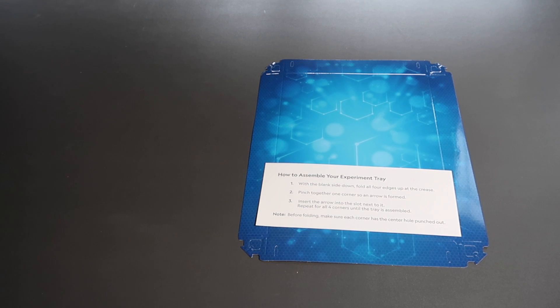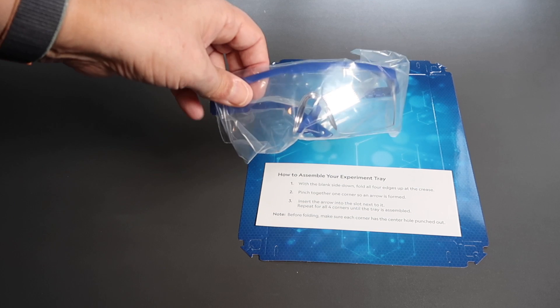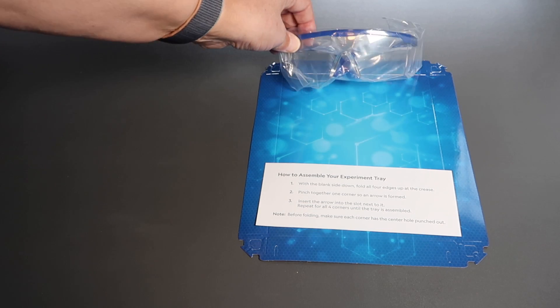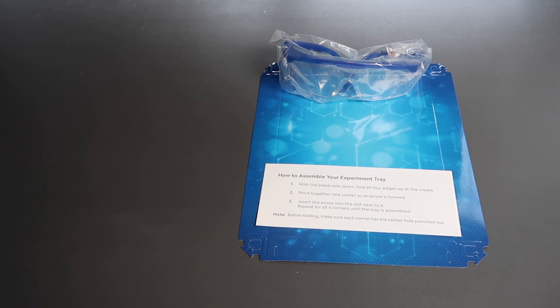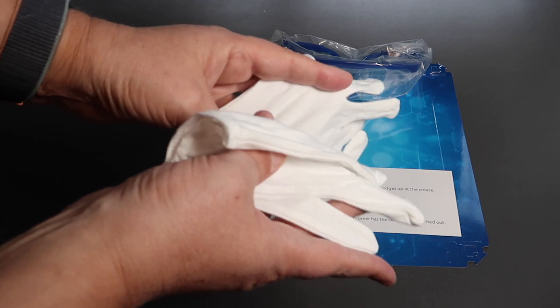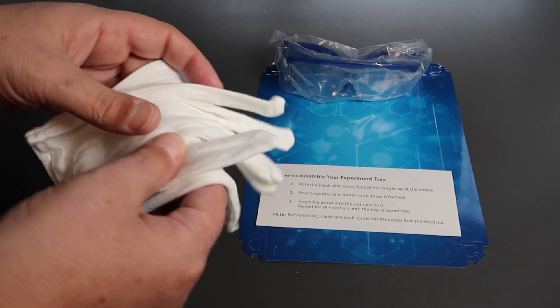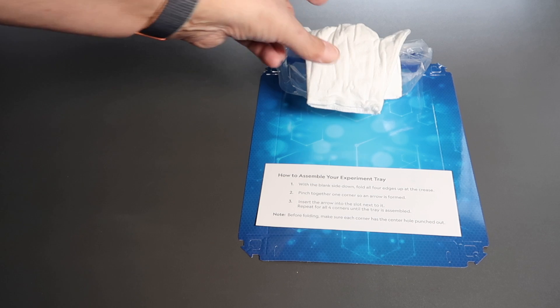What I particularly love about this kit is we have safety goggles. And because it's a chemistry set, we have gloves too. Very nicely done. Full marks for that.